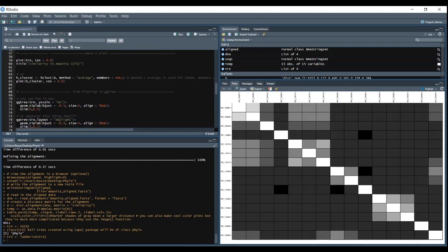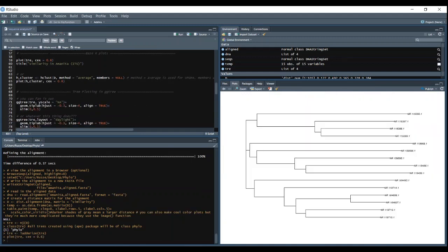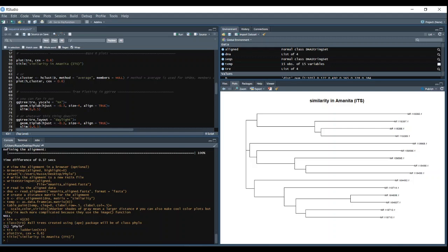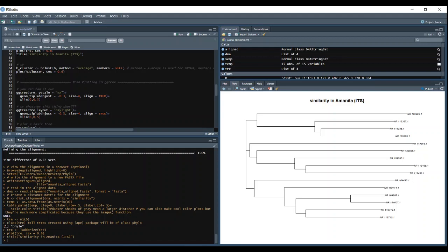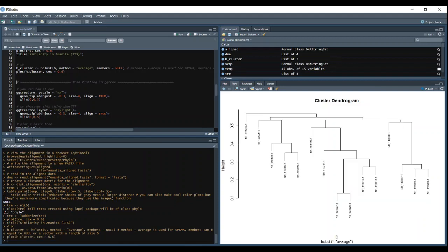You can plot trees in base R and that's fine. But I usually prefer gg tree because it's highly customizable and you can make really nice looking trees with it. With base R you can also make a clustered dendrogram. So using the height as the distances, you can see how far or how dissimilar some are to each other.